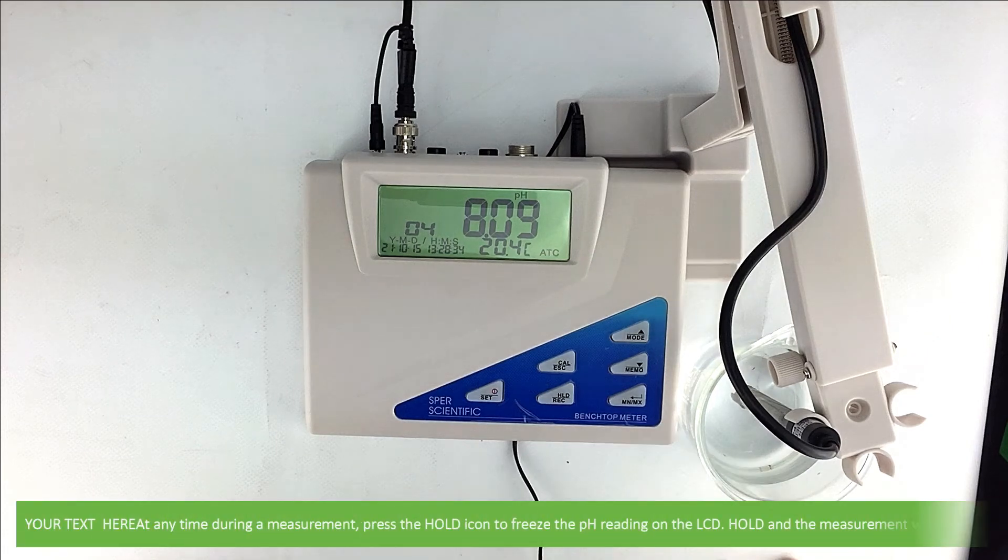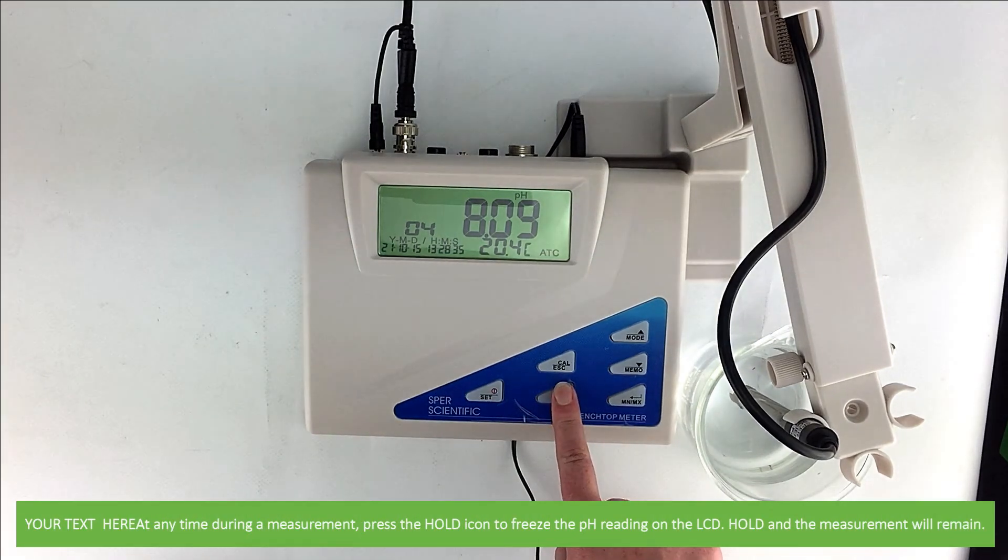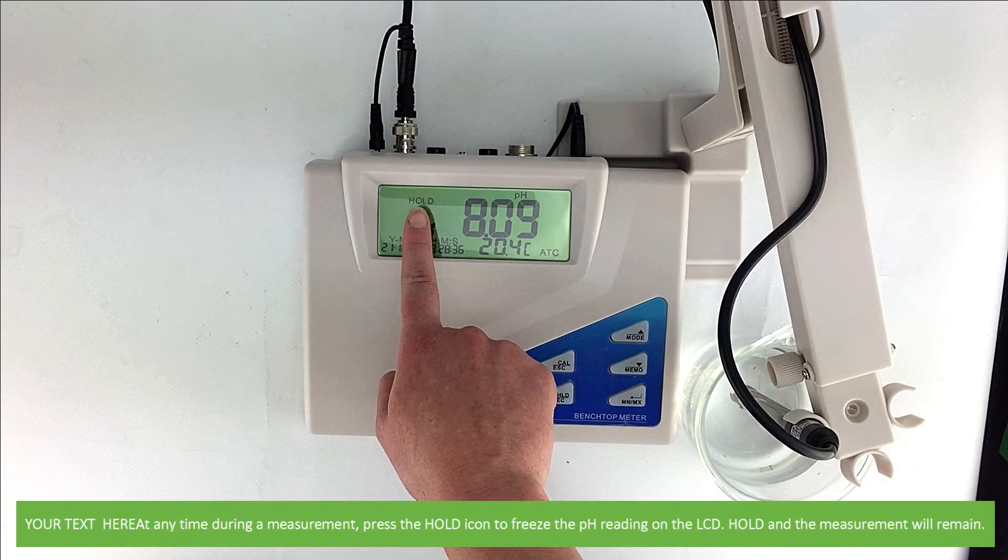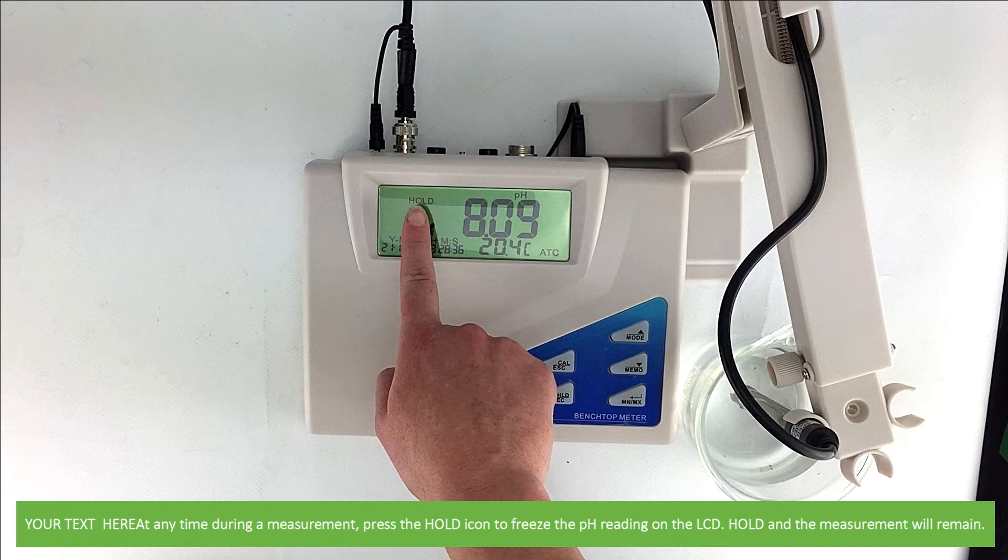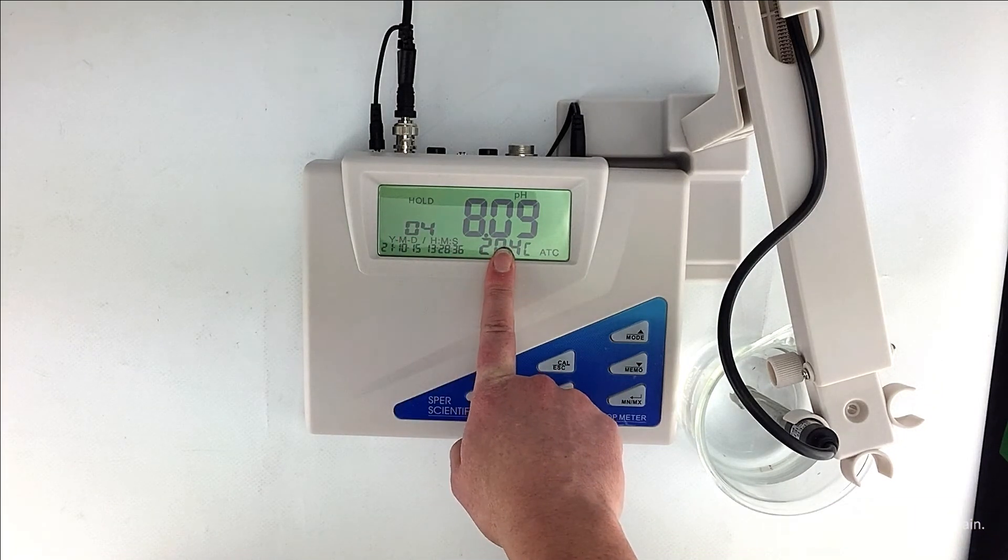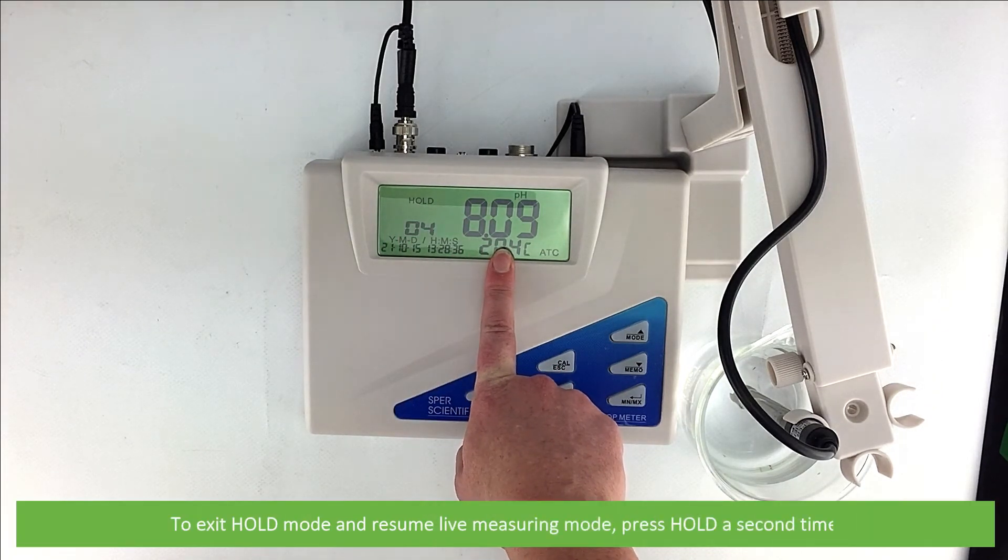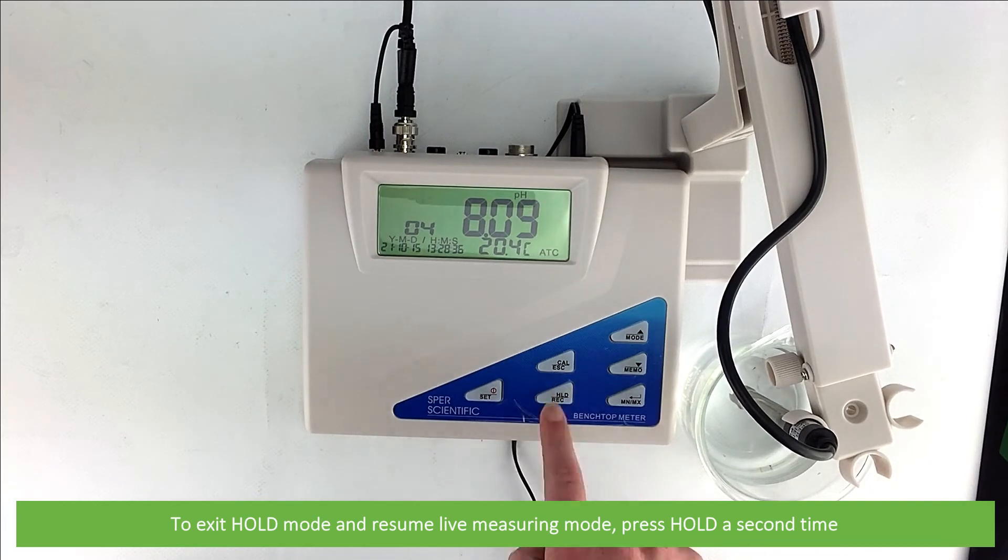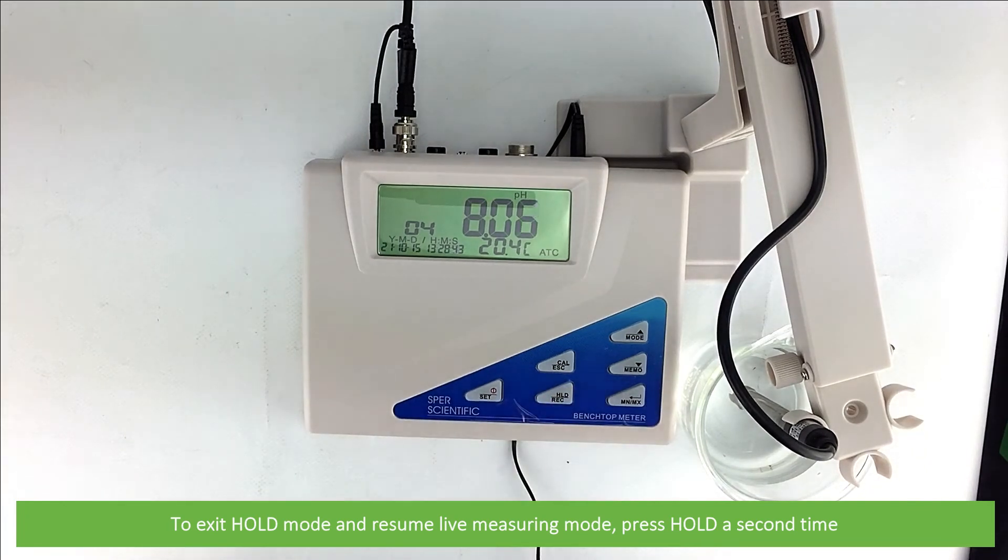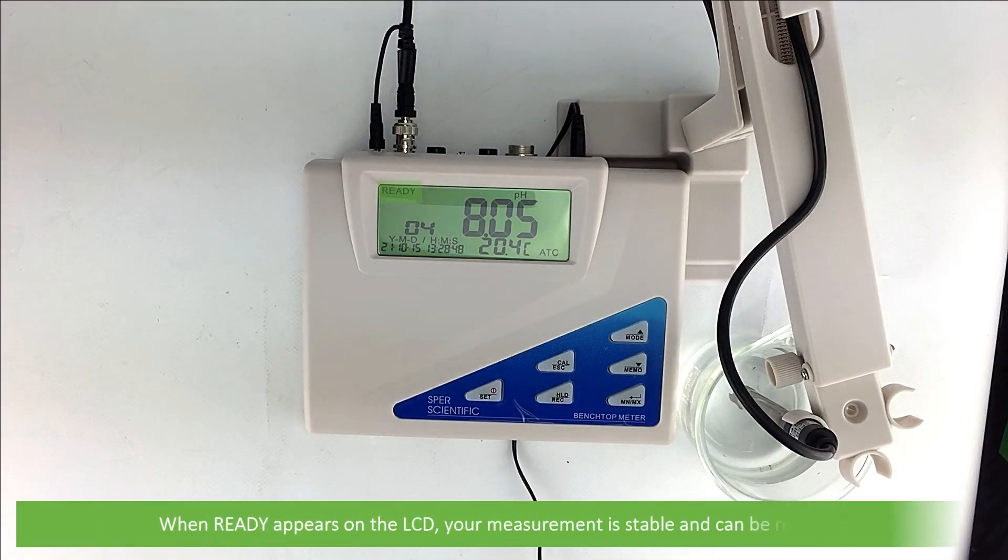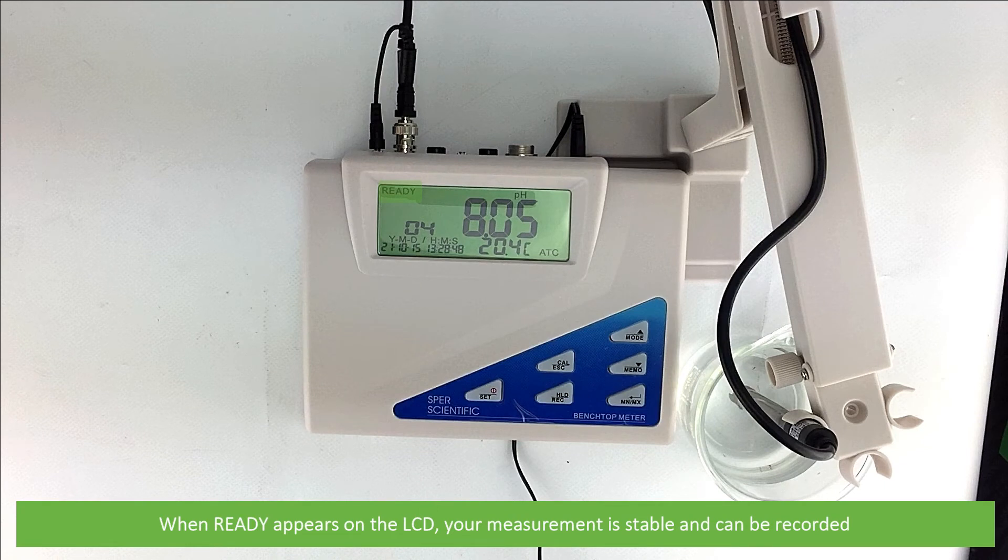At any time during a measurement, press the hold icon to freeze the pH reading on the LCD. Hold and the measurement will remain. To exit hold mode and resume live measuring mode, press hold a second time. When ready appears on the LCD, your measurement is stable and can be recorded.